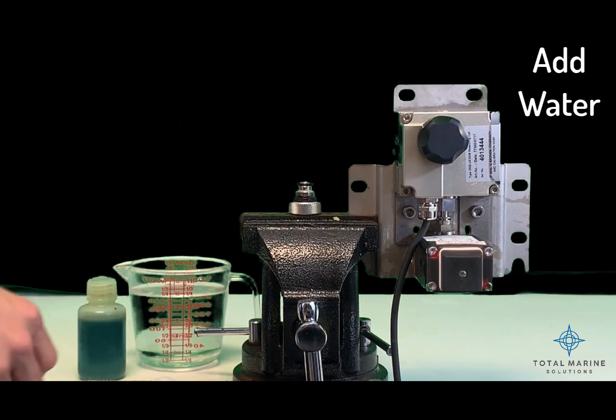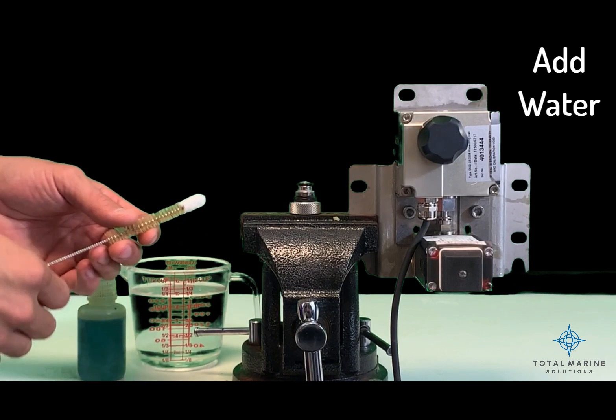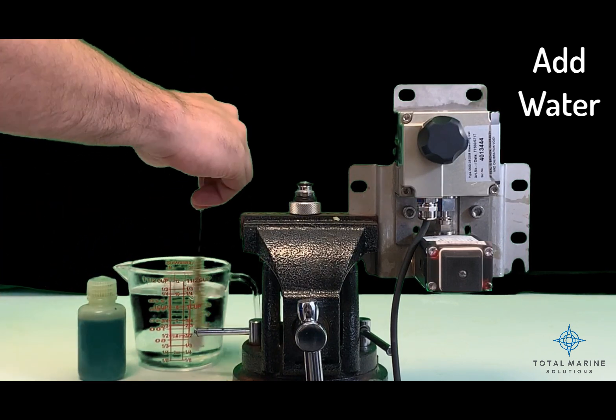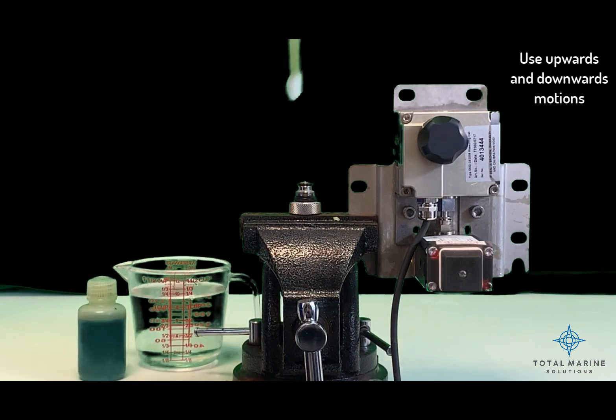Step two: use some water to wet the cell cleaning brush and use upwards and downwards motions through the cell glass.